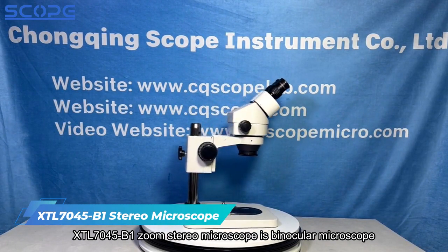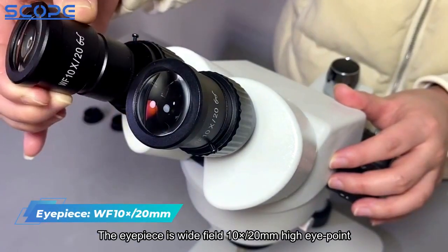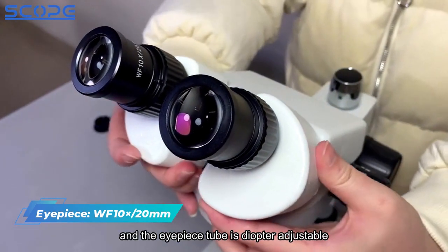The XTL7045B1 Zoom Stereo Microscope is a binocular microscope, and the pillar stand does not have a light. The eyepiece is wide field 10x, with a 20mm high eye point, and the eyepiece tube is diopter adjustable.